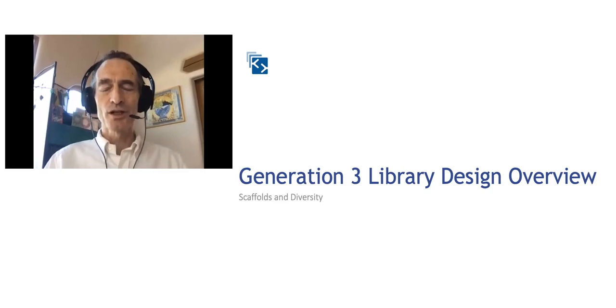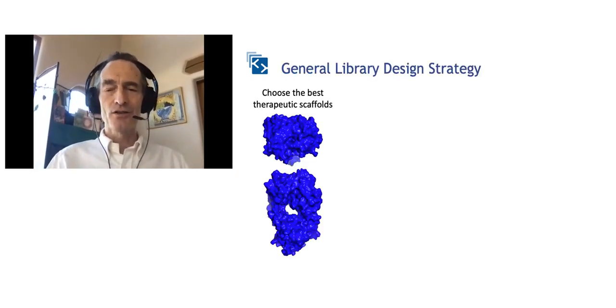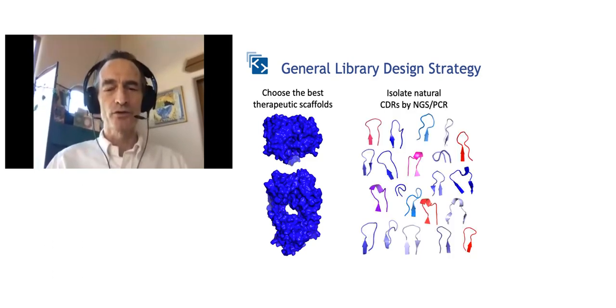So, talking about the Generation 3 library, this is a library design that we came up with a couple of years ago, and we're continually improving it. The idea is that we start off with the best therapeutic scaffolds, and by that I mean those that don't show any liability, that are well expressed, that behave well, and have been in patients, and we think this is important. Then the next step is to isolate CDRs, and these are complete CDRs, either sequencing them and identifying them by next-gen sequencing, or alternatively by PCR, and I'll explain the difference between those two things in a second.